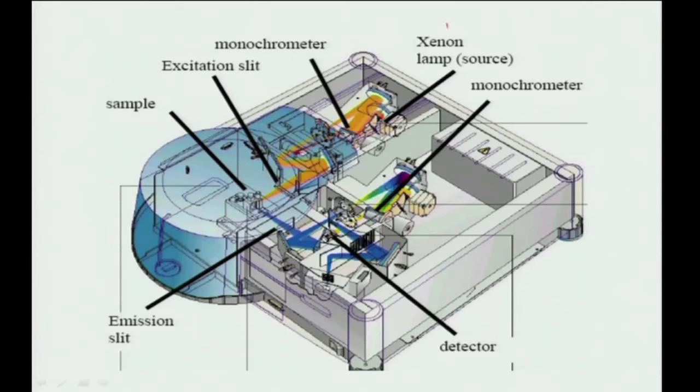This is the xenon lamp source, right. You can see this is a lamp out here. So, this is a monochromator. Here is a monochromator out here, right. From the monochromator, you can see this yellowish brown thing gives you the path of the excitation light. So, it is from the lamp, it goes here, there are mirrors, the monochromator comes through. You can see this is the excitation slit, and this is your sample compartment. Can you see this is your sample compartment, right. Okay.